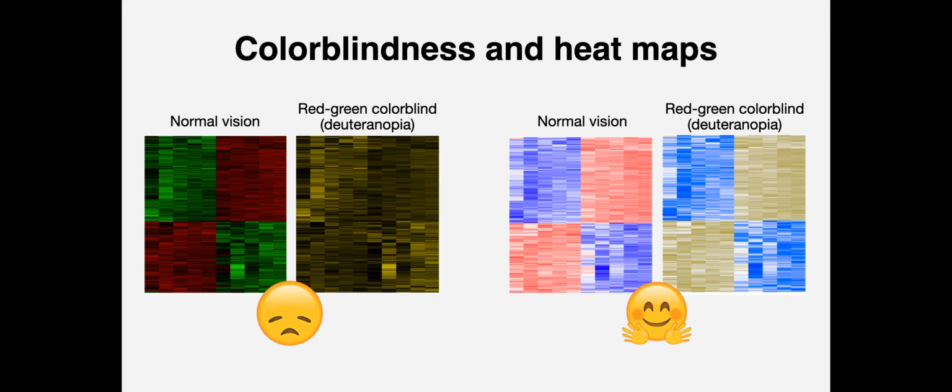Okay, so heading back to the slides, we've discussed our heat map a little bit, or made our heat map. Let's talk about a few things. The first is it actually matters what colors you choose for the heat map, as much as I joked around about the different color palettes. If you make red-green heat maps, just know that this is what your heat map will look like to people who have red-green color blindness. This is exactly the data we're using today. I just changed the color palette to red-green.